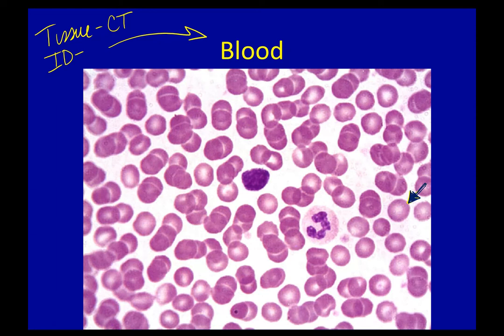These are the red blood cells. Red blood cells don't have any nuclei. Notice there's no big purple blob in the middle of them. So you've got those cells, and when you see those, you know that this is blood. If you see little cells with no nuclei, blood. Where would you find it? Don't say throughout the body, because that isn't right.